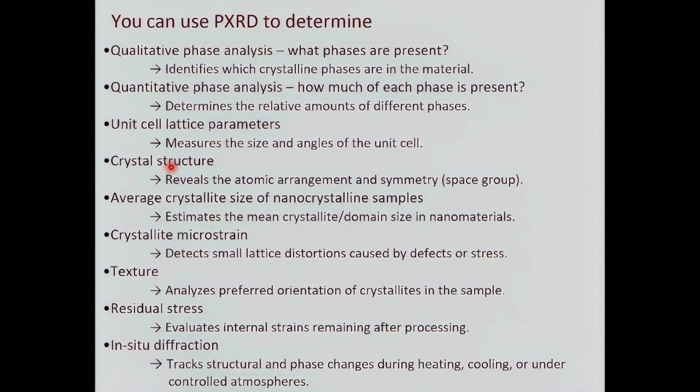Or, for example, to do what is my job, to characterize and obtain the final model in powder, the so-called crystal structure, to know where the atoms are inside the unit cell, you need to follow a sequence of steps starting from the unit cell parameter determination, followed by the space group determination, the decomposition of the experimental powder diffraction pattern, then followed by the application of methods that give you the initial model, for example, direct methods or simulated annealing, it depends.